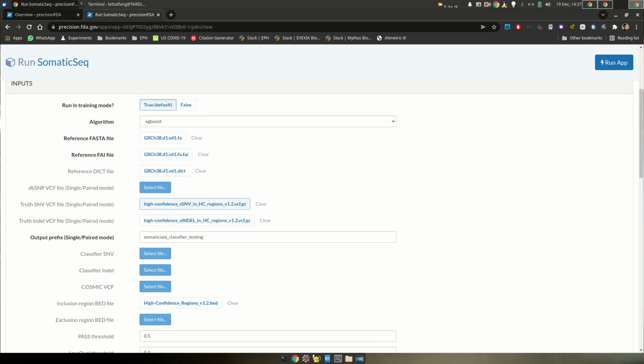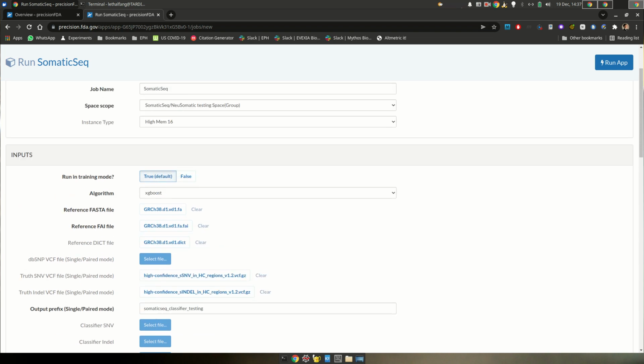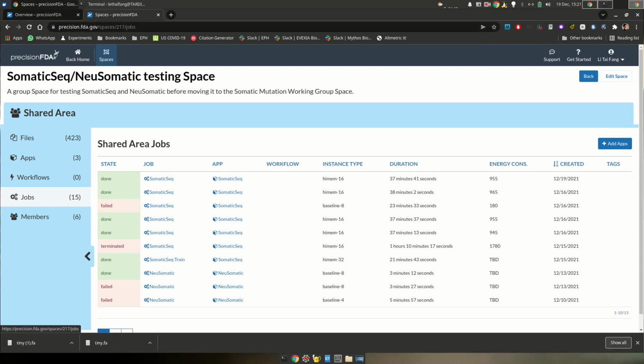You have included the truth and XGBoost training true, so you say run app, and then it's going to run the training mode for SomaticSeq, and it'll take about 40 minutes. So let's come back after that. I'll pause it. Alright, we're back. The job is finished in 37 minutes.